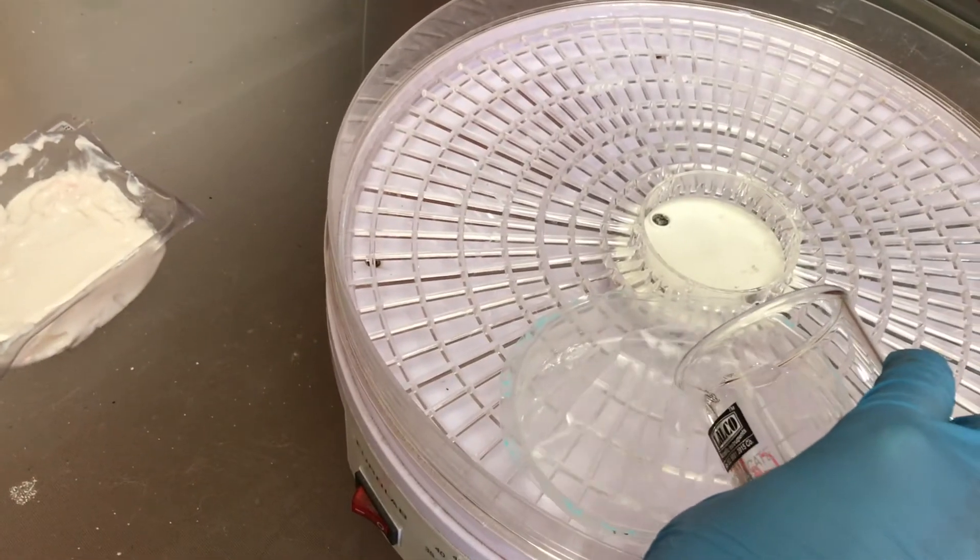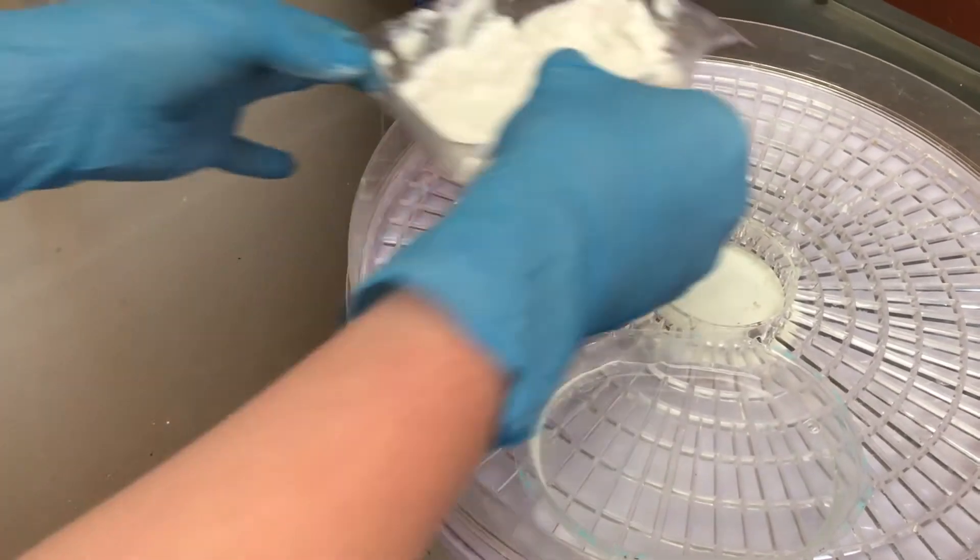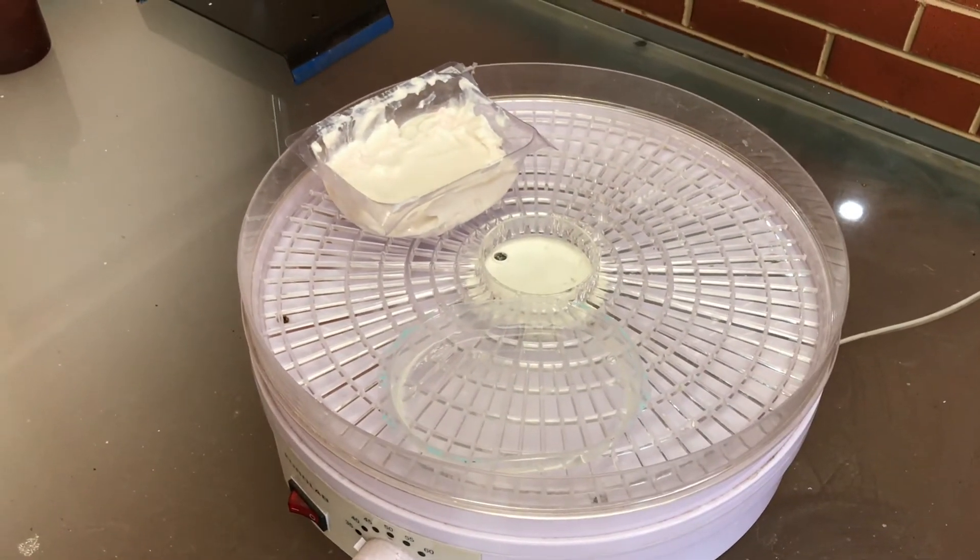I will now pour sodium acetate into a container to dry and crystallize. I will also replace the large container of calcium hydroxide to dry. Leave overnight.